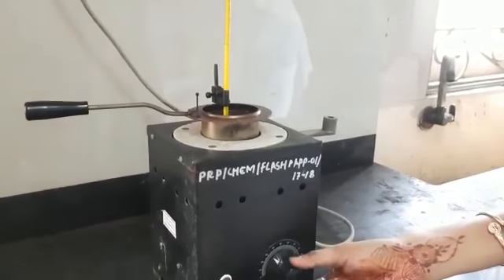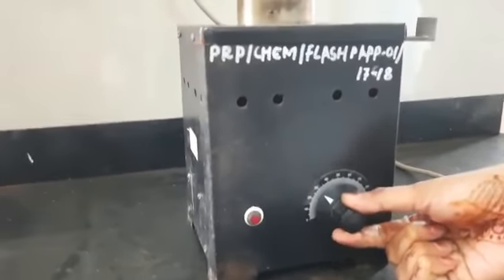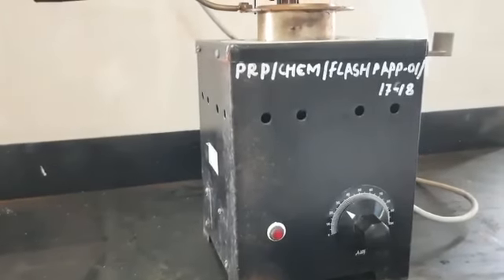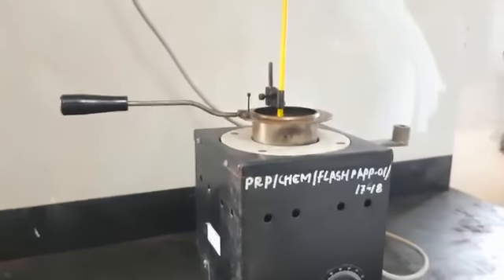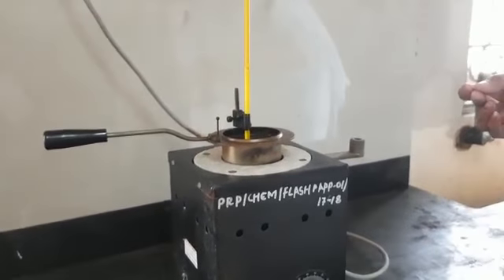We will increase the temperature to 35 degrees and check the flash point and fire point.